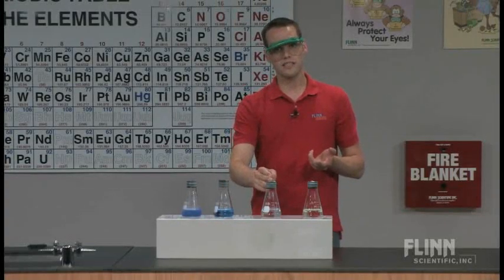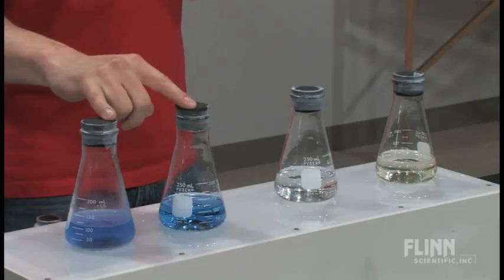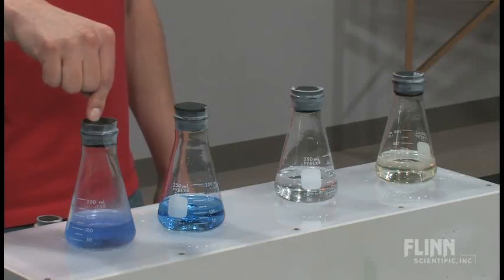Here, we don't have quite as much energy. And here, these are taking a very long time. These can take up to 10 minutes sometimes. And I usually, if this one gets really cold, down to like 2 degrees, sometimes it never even changes.